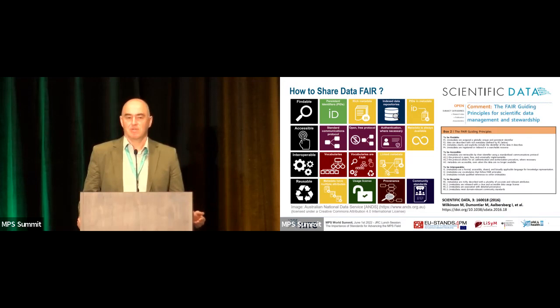to be consistently available. To have the data then interoperable, you need to use standardized vocabularies, you need to use linked metadata, so metadata catalogs that provide also a set of minimal information that you need to describe a certain aspect of your data or of your experiment.